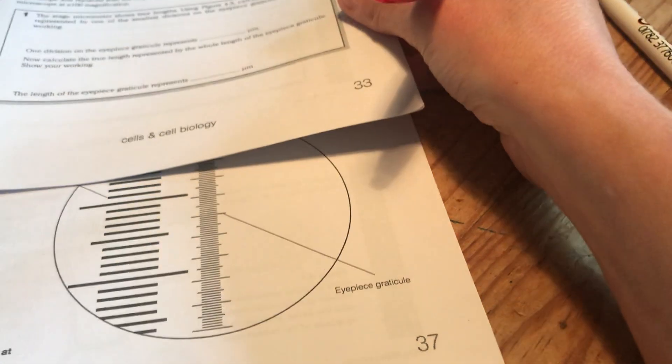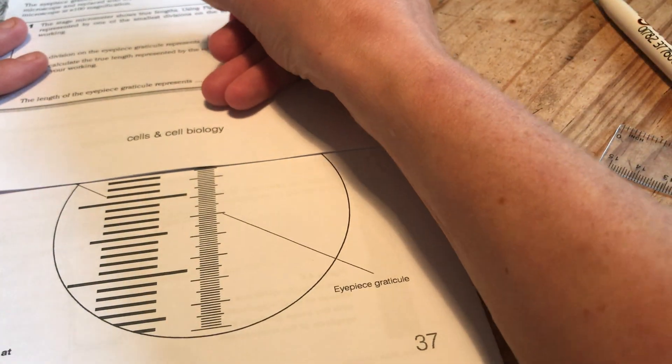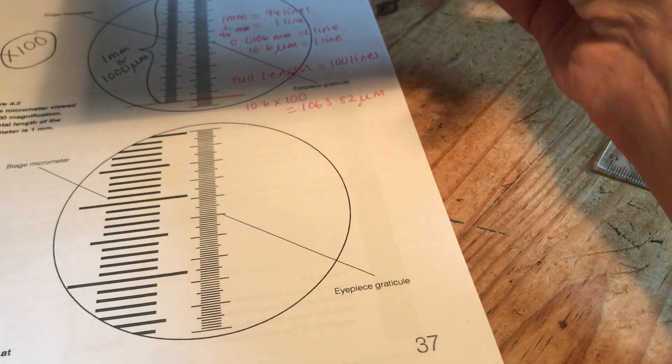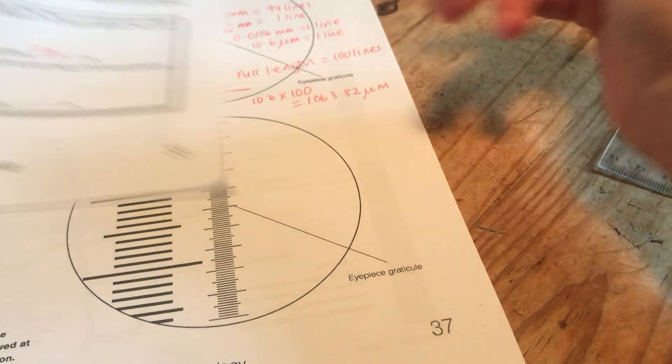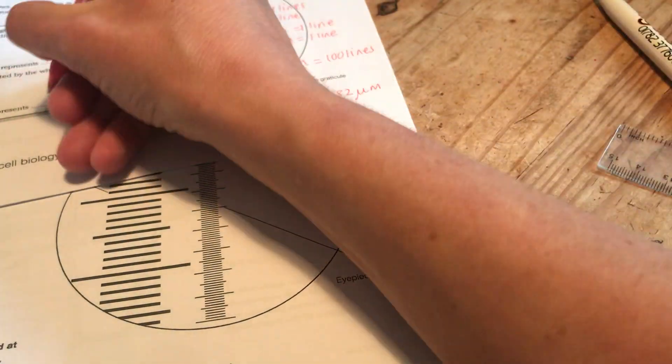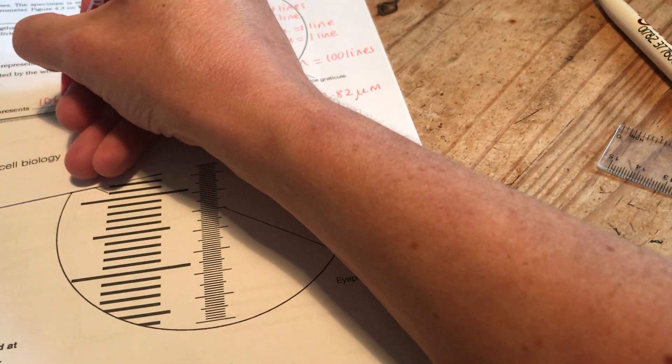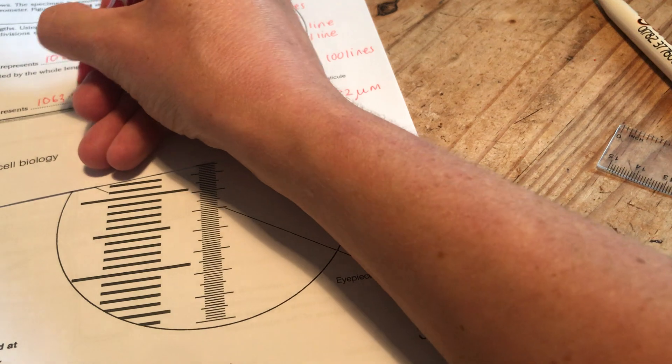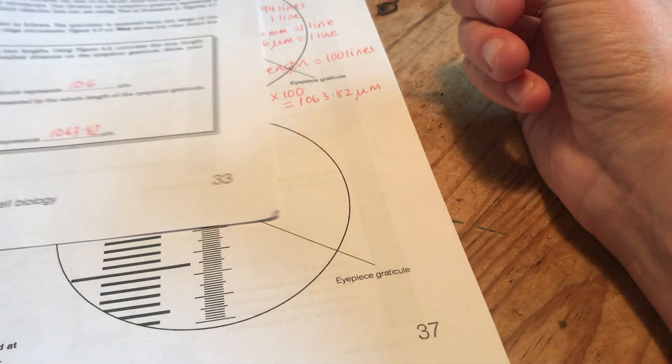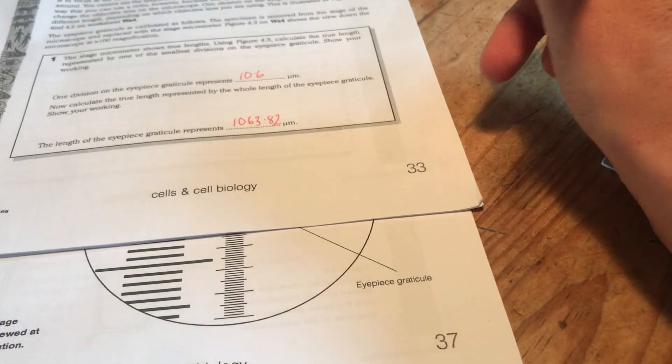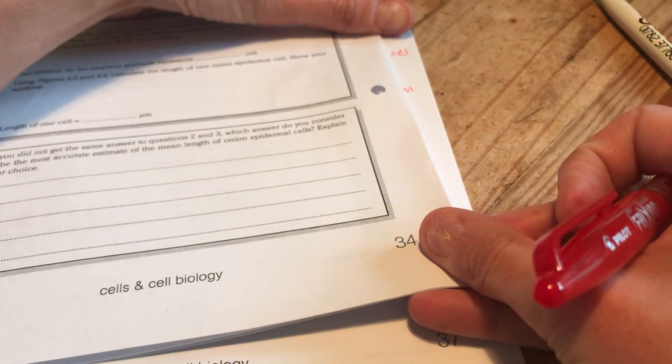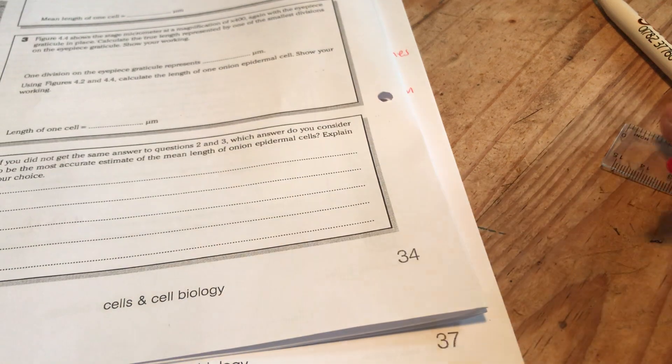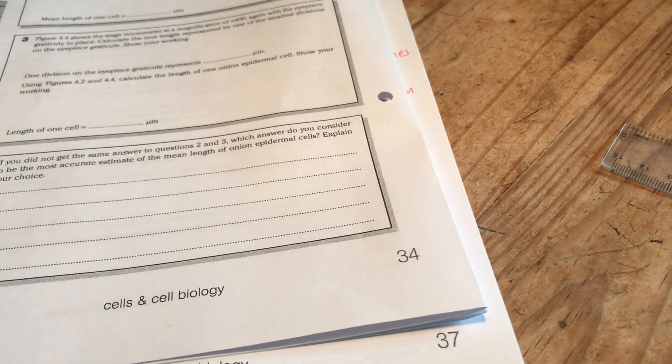So let's go back to this front cover here. We've got 10.6 we said didn't we? And we've said the full eyepiece now represents 1063.82 micrometers. Again you might get a tiny bit of a different answer to that depending on your measurements. You might be at a point now where you can do the rest of your sheet on your own and have another go at anything you've got wrong. But if you're still not feeling confident just keep watching.